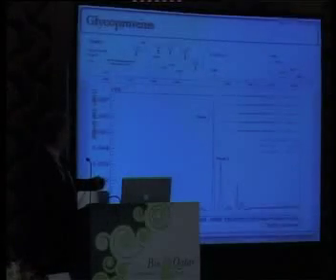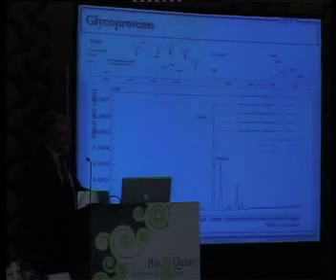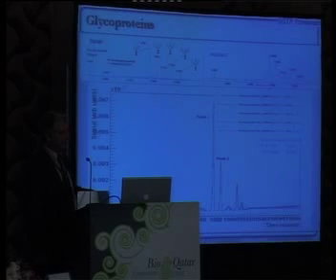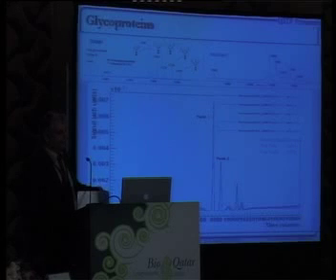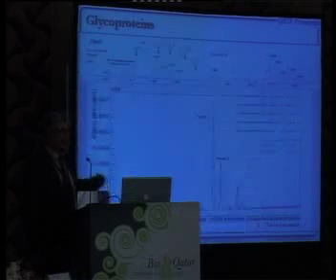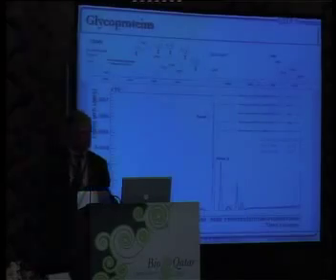This shows you sort of glycoform analysis. Top left-hand corner is mass spectrometry, and this is what the CE system looks like. And you can see that the difference between CE and mass spec is less than you might have thought. In fact, the quantification on these peaks is about 3%, whereas on the mass spec is about at least 10 or 15%.